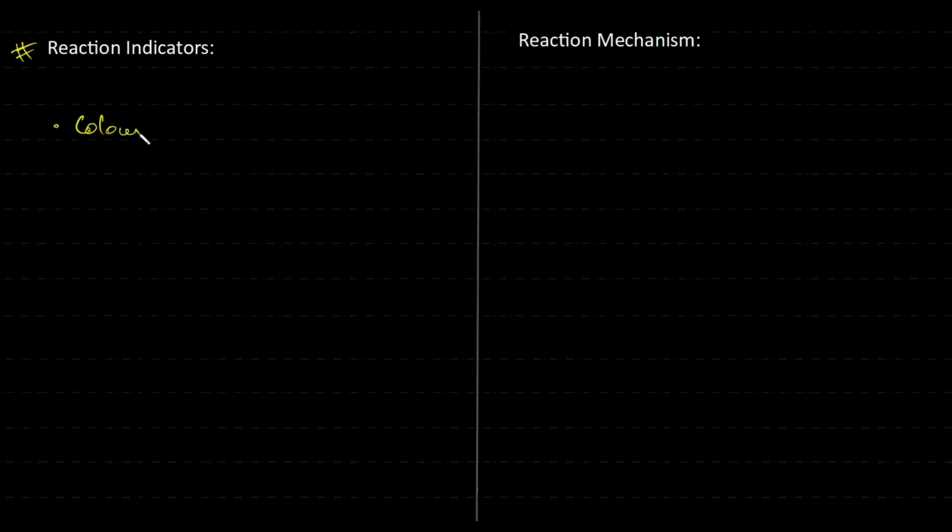How do you check that the reaction has happened? Color change. First we start with the solution. We know that this has to be blue, if not green color. This is again due to Cu2+.